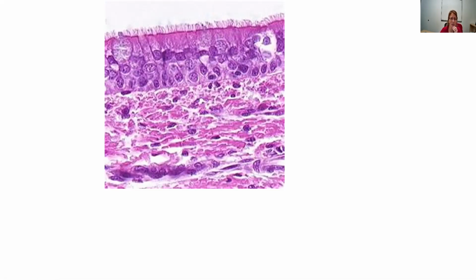Well, I don't see the elastic fibers, the ones that just look like thin, dark lines. I don't see that. It looks pretty dense, like it's not all spread out. So now I'm down to dense connective tissue, but there's regular and there's irregular. Well, it kind of looks like a mess. Dense regular tissue is more ordered, and you can almost identify specific lines of the collagen and the fibers. So this is dense irregular connective tissue.